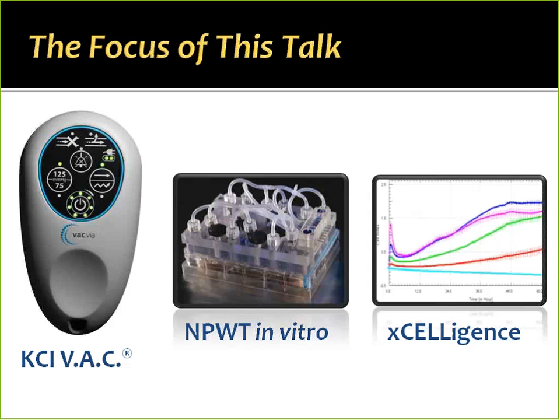One, really briefly about what KCI is all about and why we love working for our company. Then I'm going to tell you briefly about our negative pressure wound therapy system and how we use it in vitro on primary cells. And of course, I'm going to devote the majority of the talk on some experiments we've done in the laboratory, proliferation and migration assays using the xCELLigence, which is really why we've all tuned in this morning.